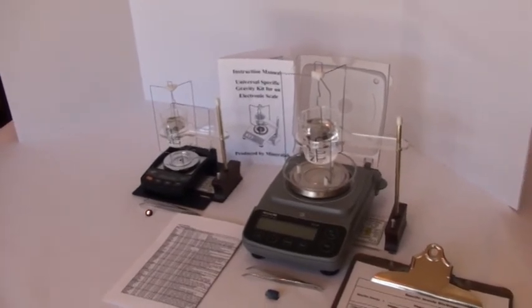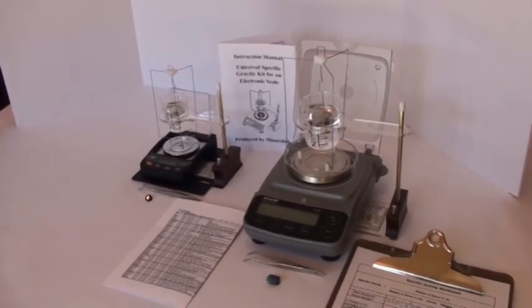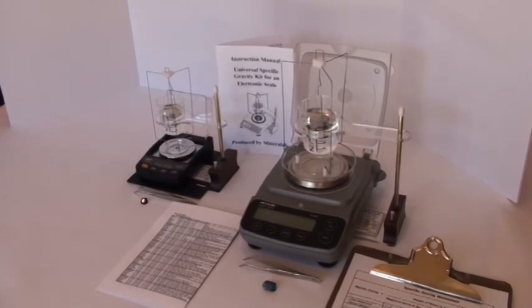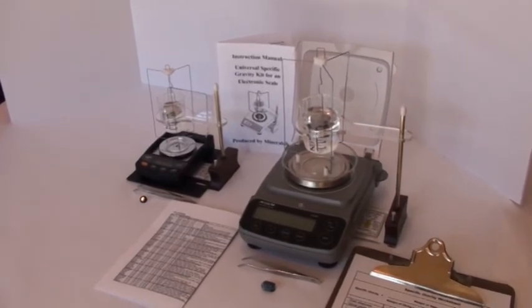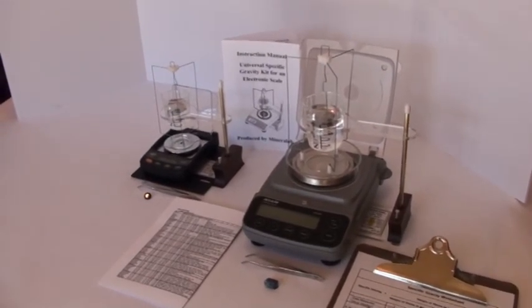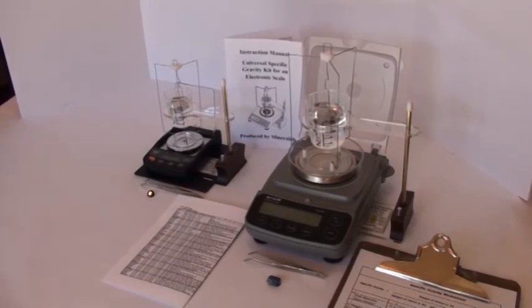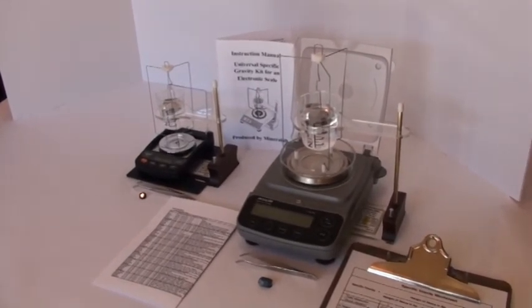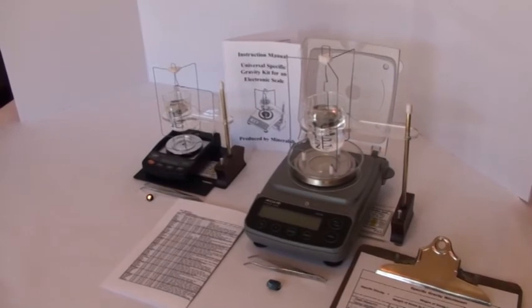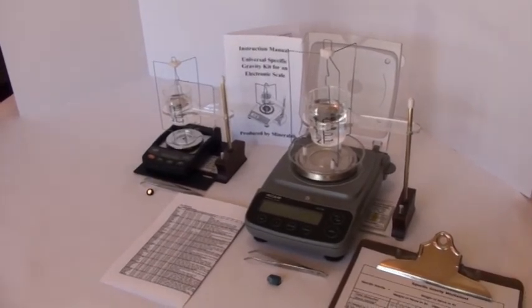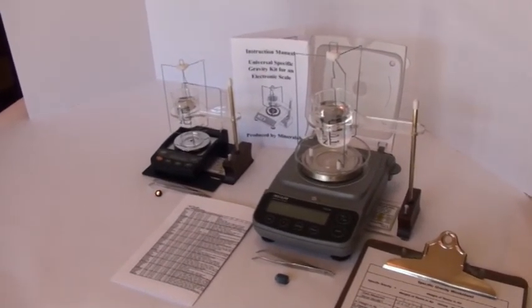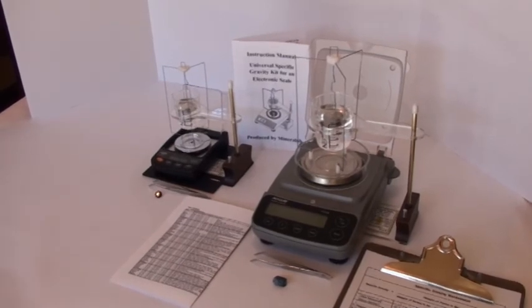Now we all are familiar with using an electronic scale to weigh an item, but what we did was develop an above-the-scale specific gravity kit so that you can use that same scale for SG measurement. This process and method is quite user-friendly and it's also very accurate, providing your scale has reasonable sensitivity.